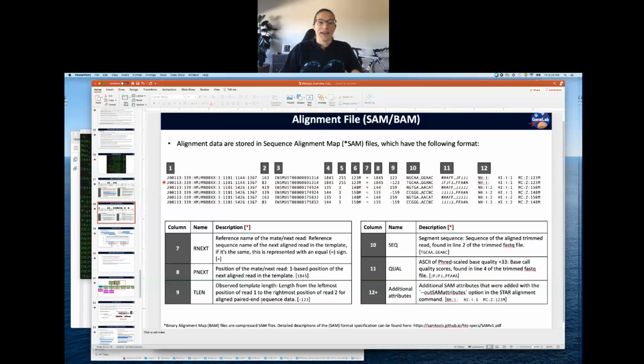And so I basically did some Unix commands. What I did is I uncompressed the transcript file, which of course is in BAM format, to get SAM format using SAM Tools View. And then I used a grep command that I think we talked about once or twice when we were trying to troubleshoot something else. And I did that for each gene, and then I pulled out that column 9.